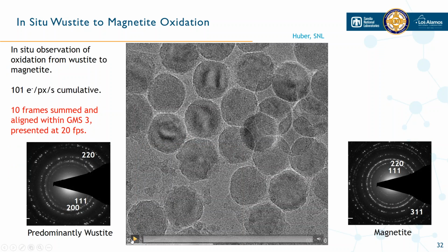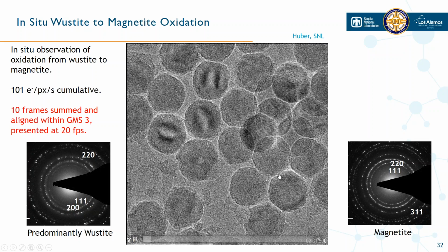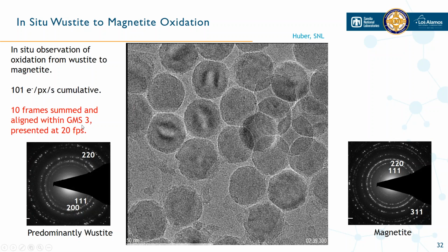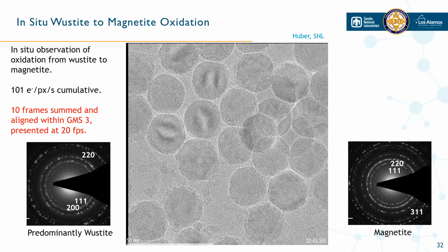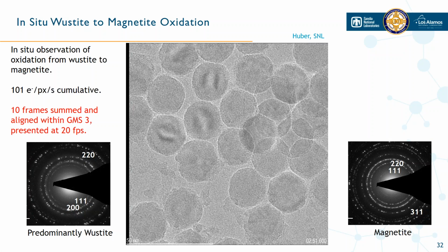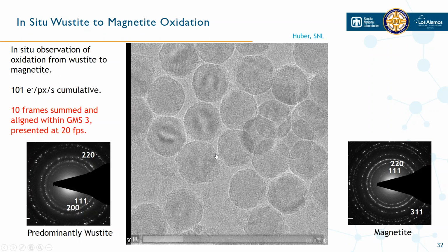So if we play the video, you can see hopefully that you've got nice atomic resolution. These are framed, so 10 frames are summed and presented at 20 frames per second. And you're seeing that you have nice atomic resolution.